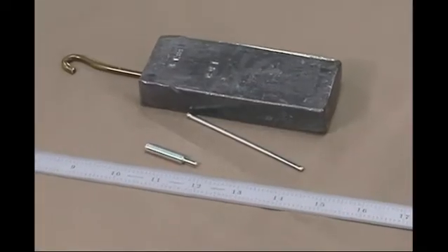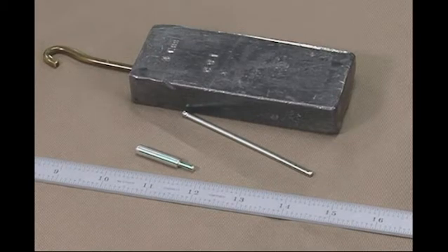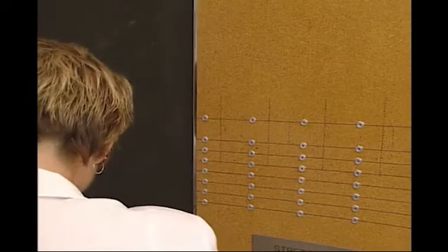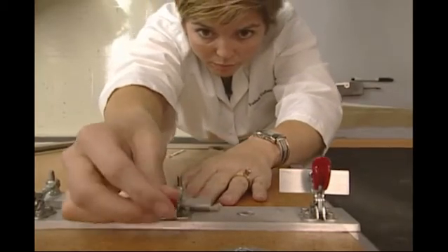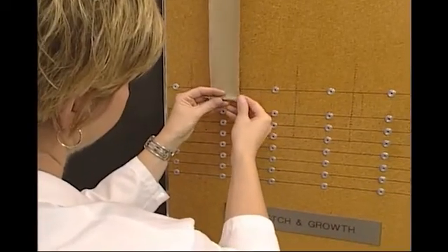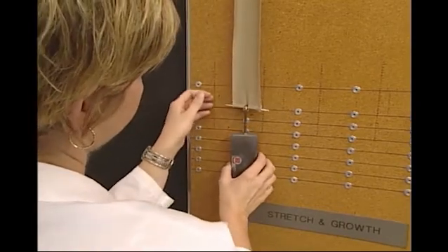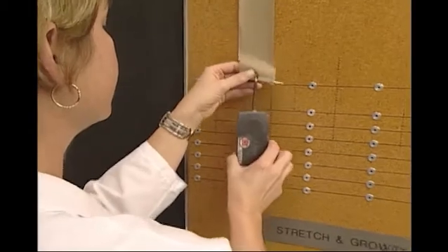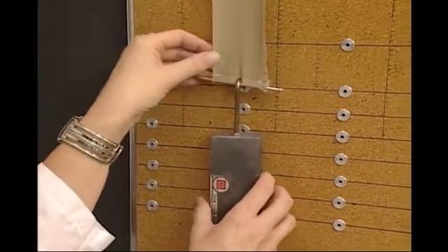The standard method allows for 2 tensions to be used, a 3 or 4 pound weight. The option of which weight to use is usually specified in a material performance specification that is likely to be based on the weight of the fabric. The test is performed by placing the non-sewn end of a specimen into the upper clamp of the stretch frame and locking it in place with a clamp. A dowel pin is inserted into the cutout notch on the lower edge of the specimen. Then the selected weight, either 3 or 4 pound, is placed on the dowel pin, supporting the weight by hand. The application and release of the weight, or tension, is cycled 3 times.